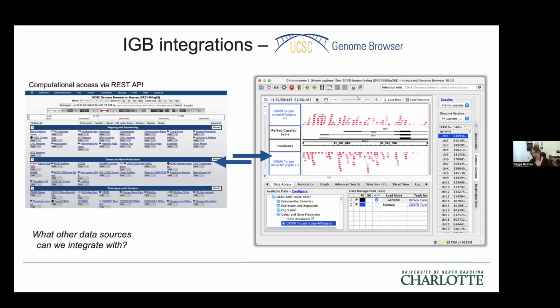A lot of researchers that use UCSC get really familiar and comfortable with these data tracks, so it was hard for them to switch between browsers when the data they needed was stuck on one genome browser. So Shravani integrated UCSC with IGB so that we could pull those data tracks into IGB, and then anyone using IGB could load the same data between browsers.